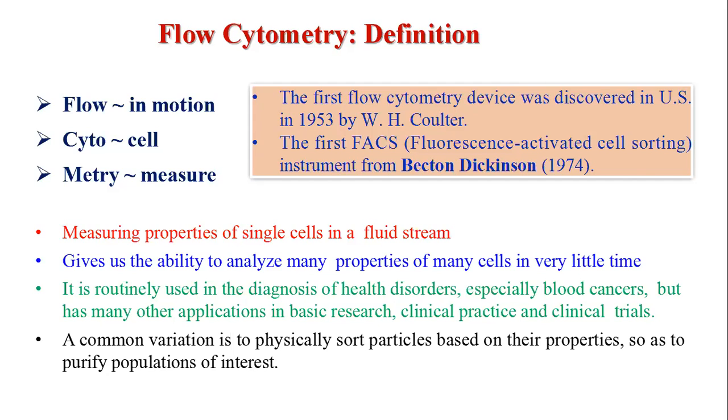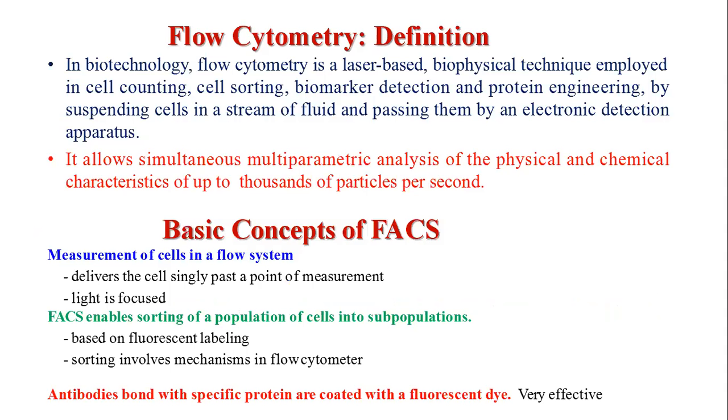For purification, or to identify antibodies present in a particular type of cells, you should use this instrument for identification from a different population of cell types.